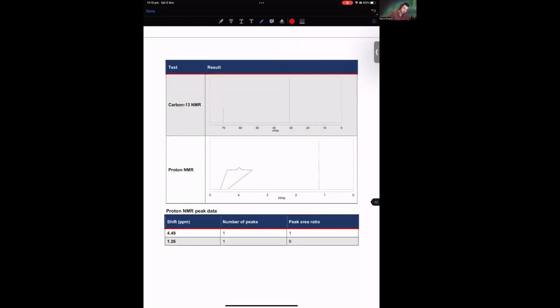Now, carbon NMR, I'm going to just label these arbitrarily peak 1, peak 2, and we can see here quite a big height difference between these, potentially 2 to 3 times larger. And while it's hard to quantitatively use this, it does give us an indication that there are likely more carbons that fit peak 2 than there are peak 1. So we'll keep that in mind as we go through, and the proton should hopefully give us a bit more information about that. The other thing to note is that peak 2 is sitting in the alkyl carbon region at about 30 ppm.